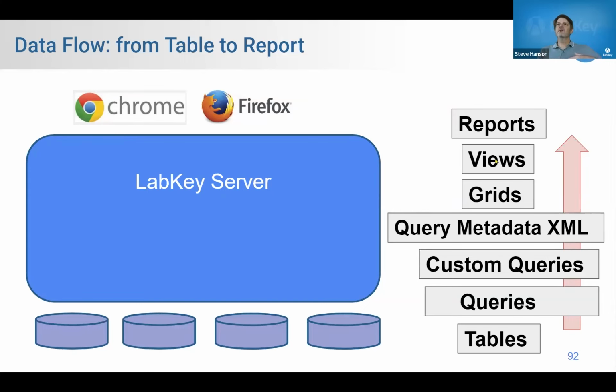A report is, I define a report as the final thing consumable by an audience. Like the audiences come to LabKey to see reports. And so that's kind of the final presentation. So that's kind of the whole history, or the whole flow from databases to the final consumable. And if you know what you're doing, you can use any or all of these intervention points in the flow to control stuff.